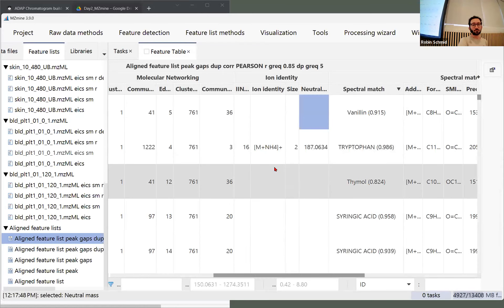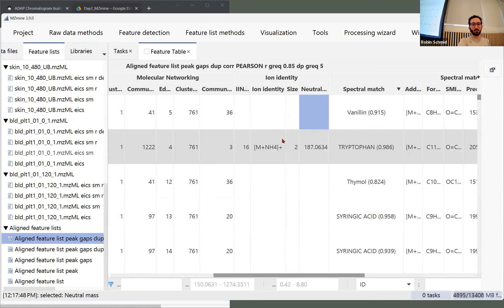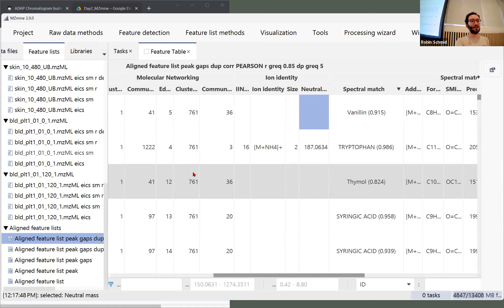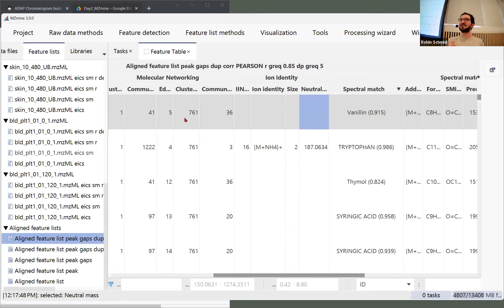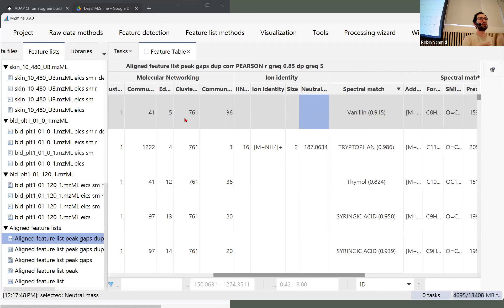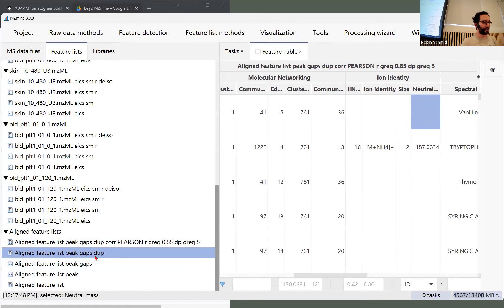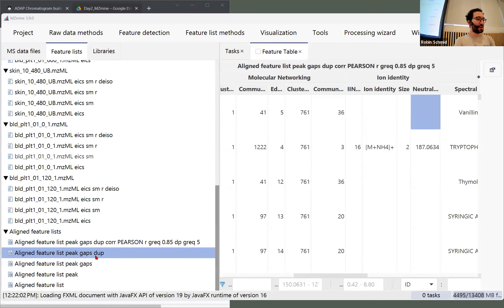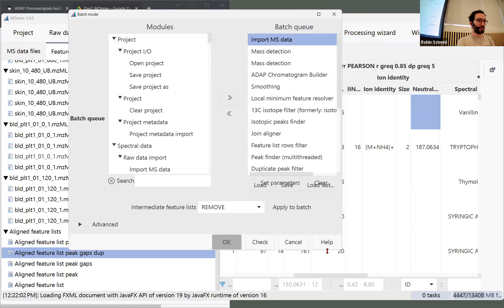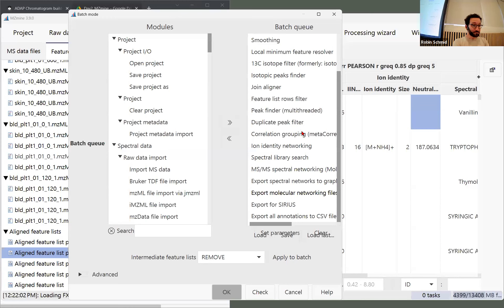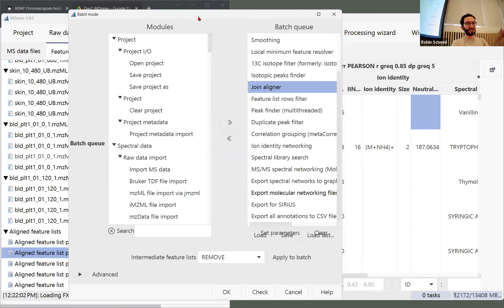Before going into the molecular networking parts in MZmine, it's nice to look at alignment and then also very important to optimize resolving. Does anyone have questions about alignment? About resolving we'll do afterwards. Regarding the three aligned feature lists with gaps — we kept all the intermediate steps so we can backtrack errors. If I open the batch mode (Ctrl+B or from the menu), I can see we applied 20 steps: the first was the join aligner creating an aligned feature list from multiple samples.